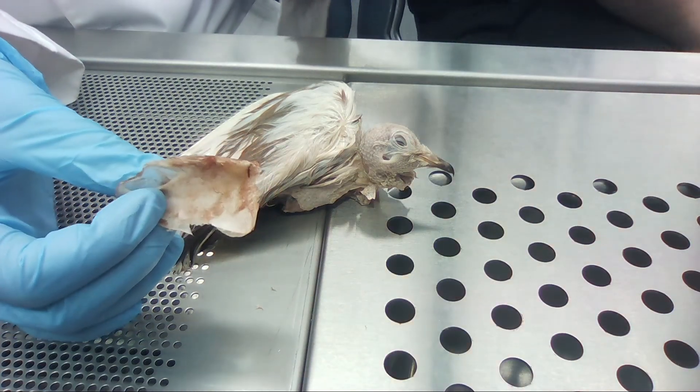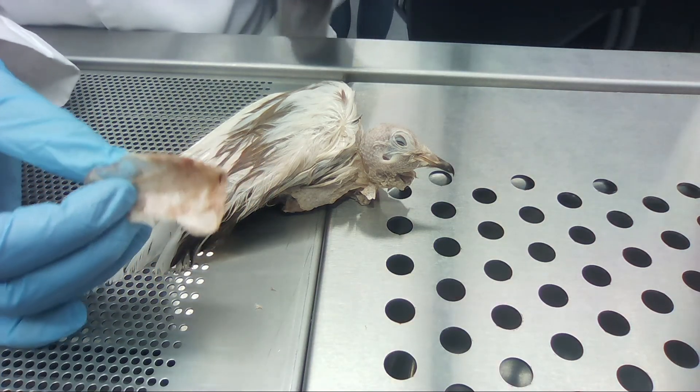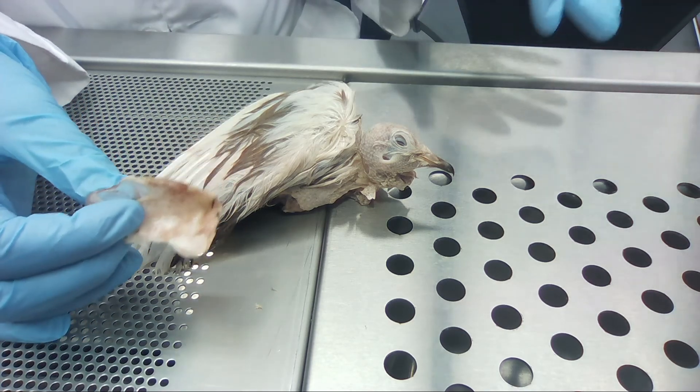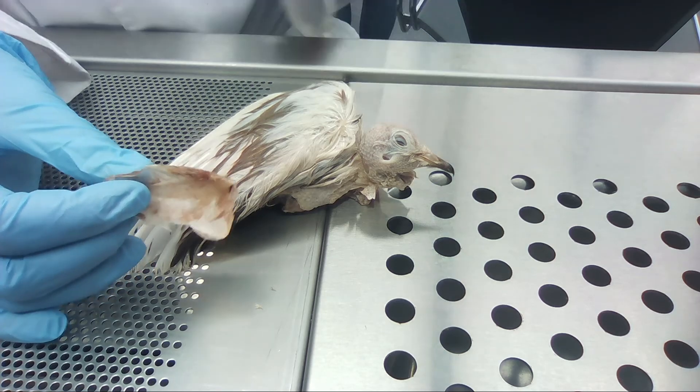Today we have a male pigeon and I'm going to tell you a little bit about their general bone structure and then we'll get into the internal anatomy.